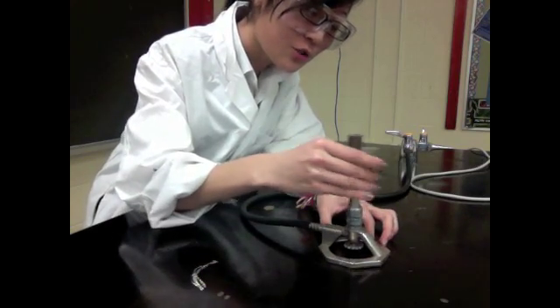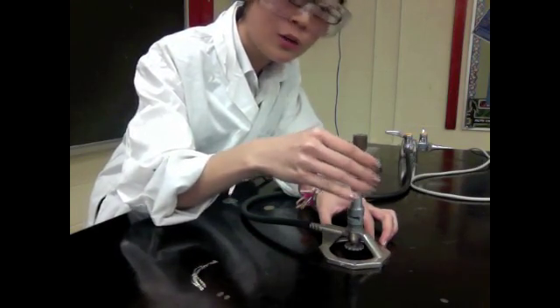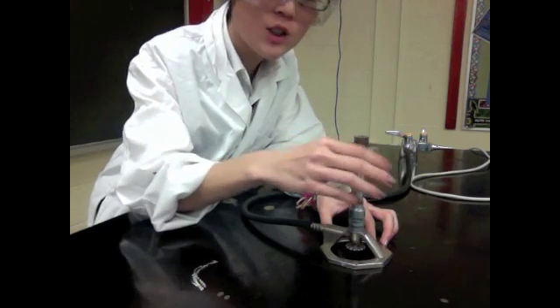There's also the oxygen tube here, which if you screw or unscrew it, allows the amount of oxygen being allowed into the tube.